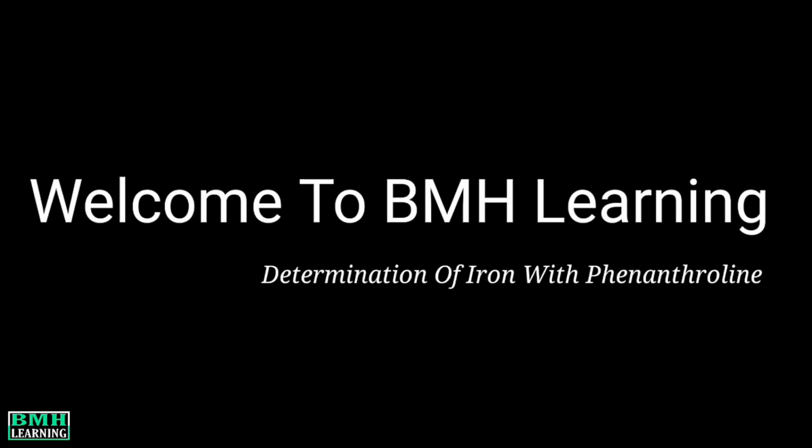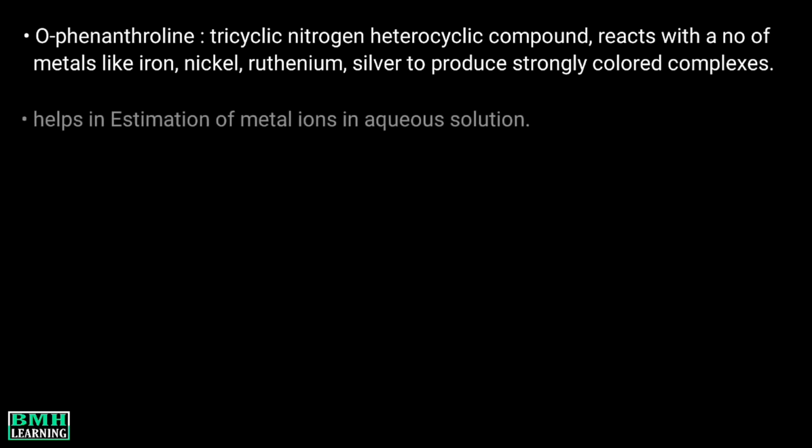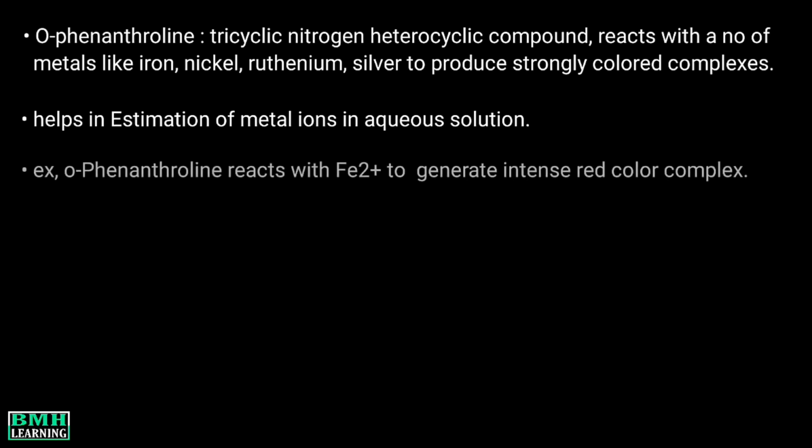In this video, we will talk about determination of iron with phenanthroline. Orthophenanthroline is a tricyclic nitrogen heterocyclic compound which reacts with a number of metals like iron, nickel, ruthenium, and silver to produce strongly colored complexes. This property is very useful in providing an excellent and sensitive method for estimation of these metal ions in aqueous solution. For instance, orthophenanthroline reacts with ferrous ion to generate a complex with intense red color.